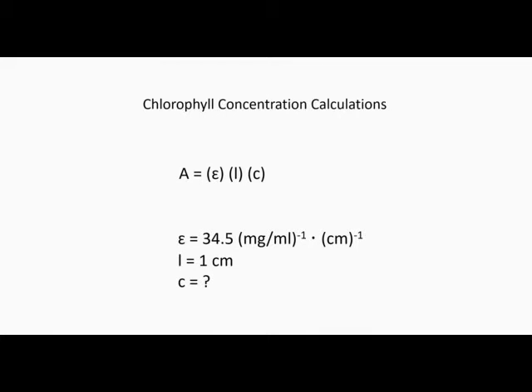Okay, before we get started with our experiment today, using our chloroplast that we prepped, I wanted to go back over the actual calculations that I asked you to do. Those calculations you should have already done, and they should be recorded in your lab notebook. I just wanted to double check, make sure we're all on the same page here.